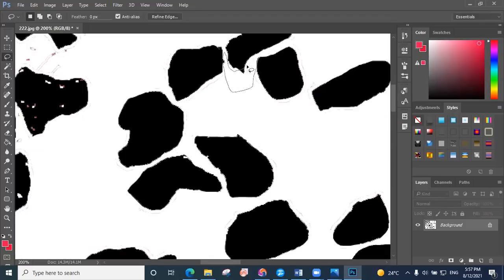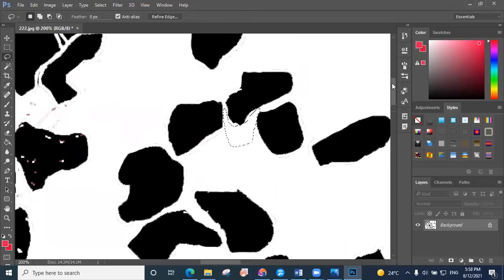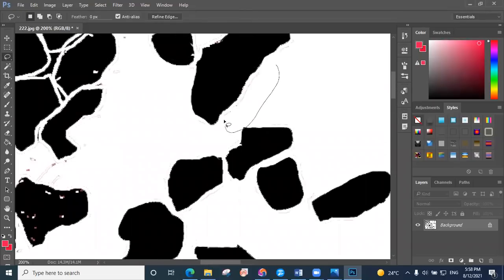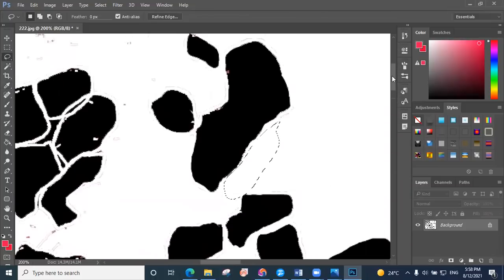You can determine the grain size without cleaning, and then make a filter for the results. But it's better to clean, because the filter will not be exact or accurate unless you clean the dots inside the picture.